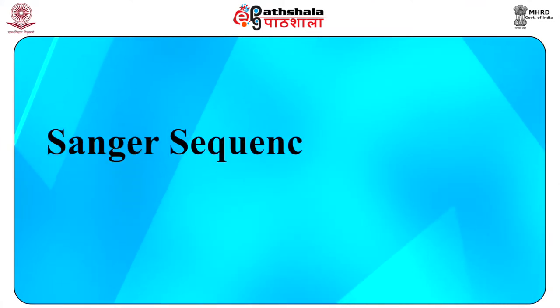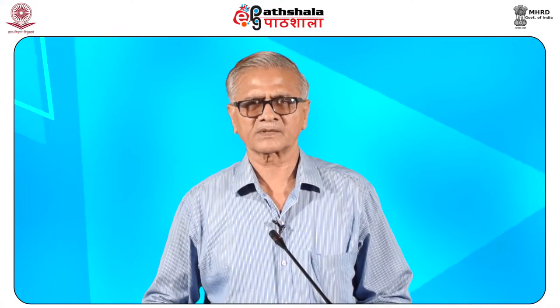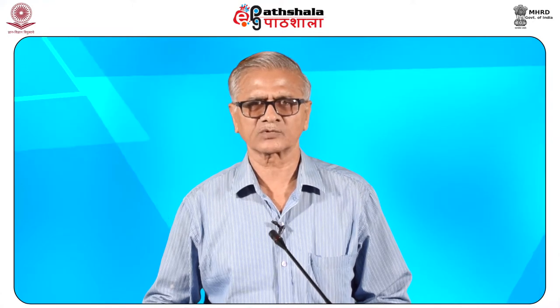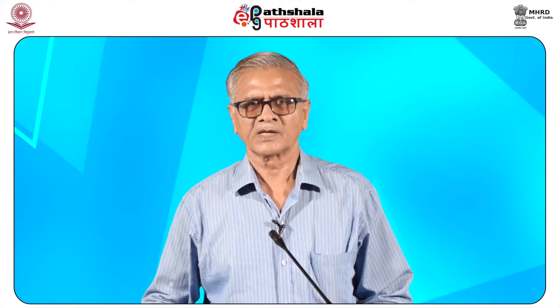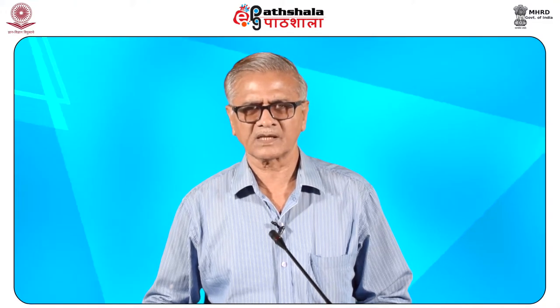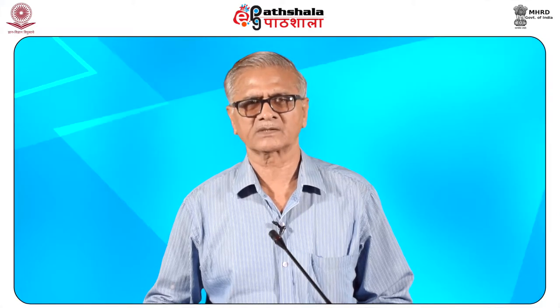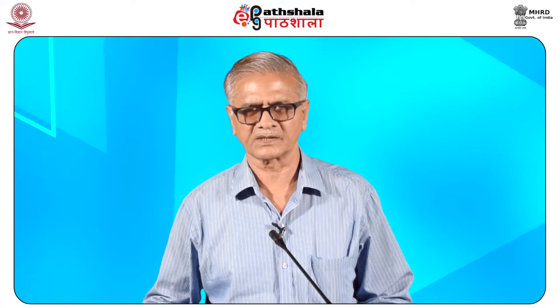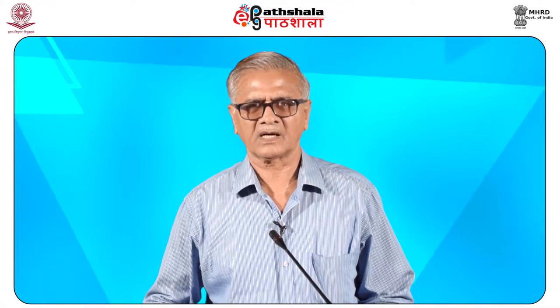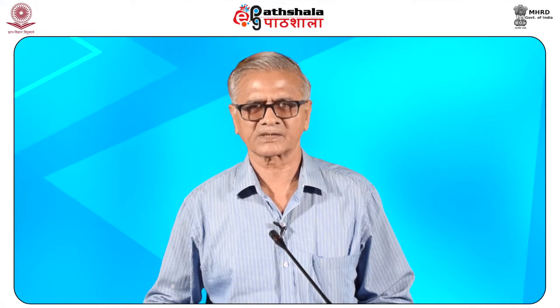The another method is Sanger sequencing method. Frederick Sanger developed several faster, more efficient techniques to sequence DNA. Indeed, Sanger's work in this area was so groundbreaking that he got the Nobel Prize in Chemistry in 1980. The two key methods developed by Sanger are called chain termination and dideoxy terminator sequencing.